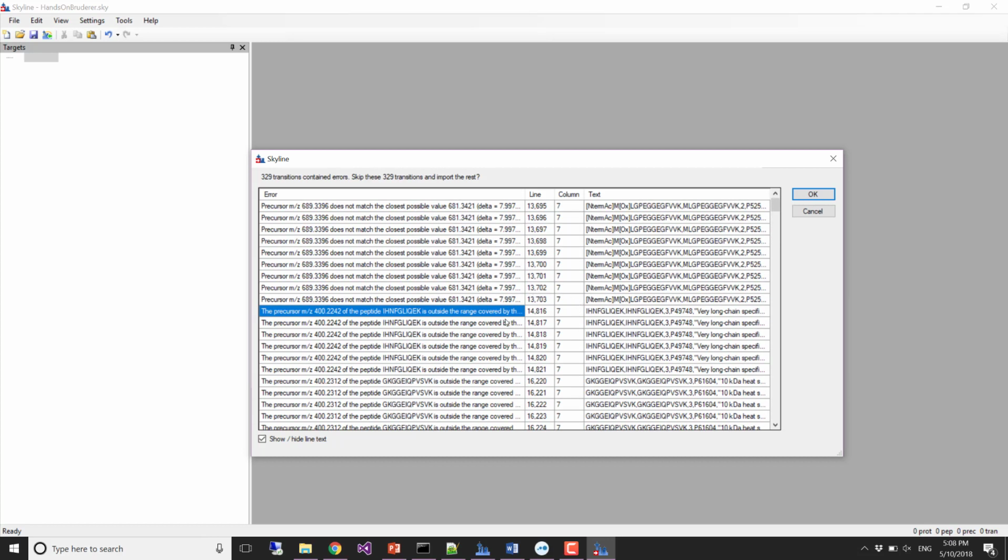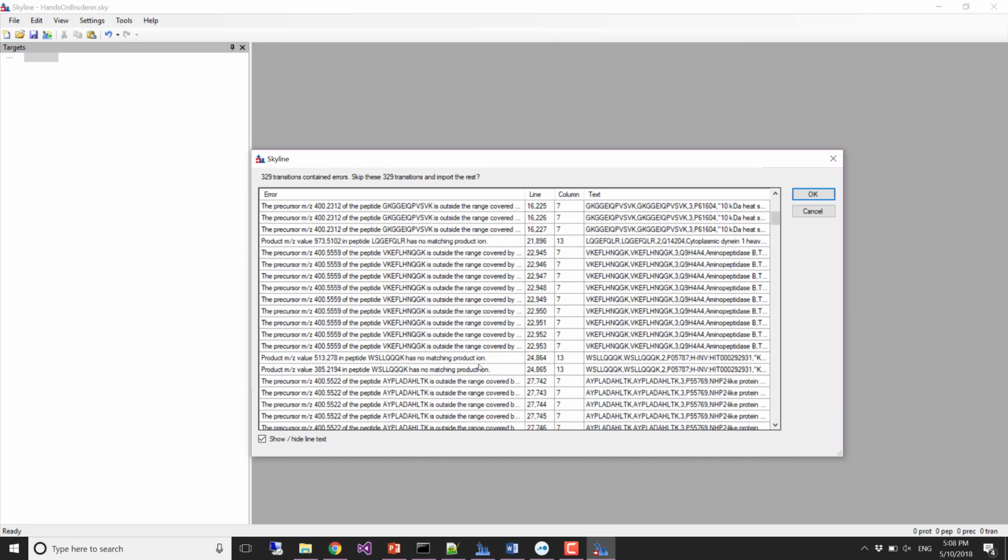Yeah, so what is that? Product ions. Yeah, if you had a whole lot of them, I would worry about them. In this case, I'm not going to worry about them.